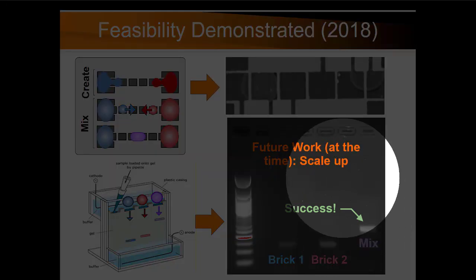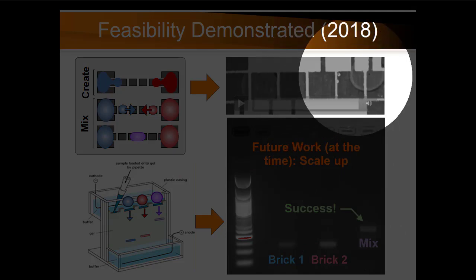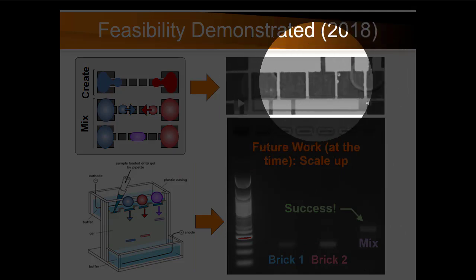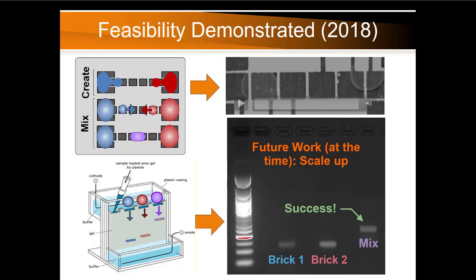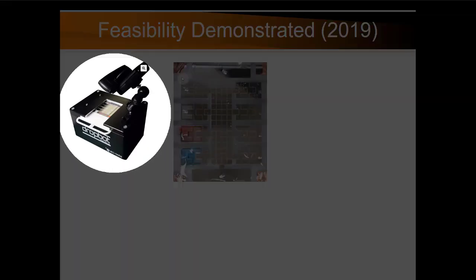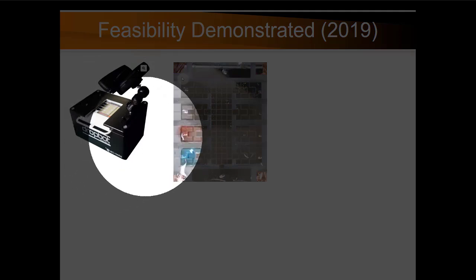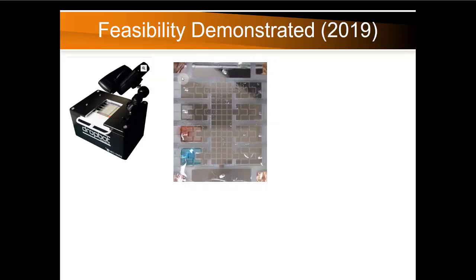Because the inkjet printed devices are nice for proof of concept, and moving stuff around, two droplets at a time, it's good. It shows that it works, but we want to be able to scale things up. So this is plug and play. This is maybe like 8 inches by 4 inches, and it plugs into your computer like a USB, and then you can control devices like this.